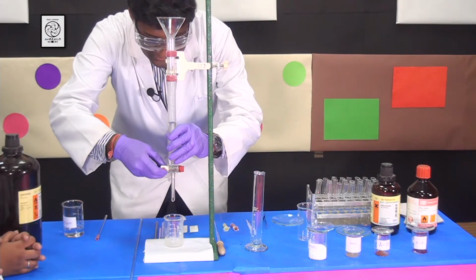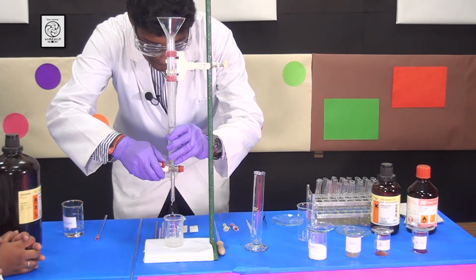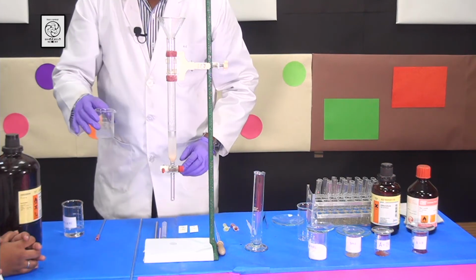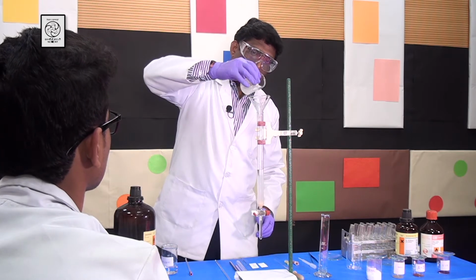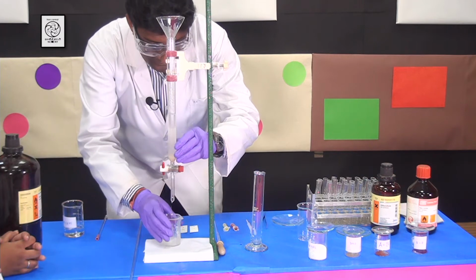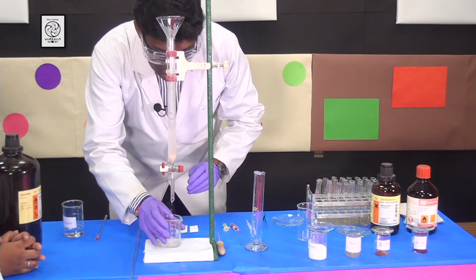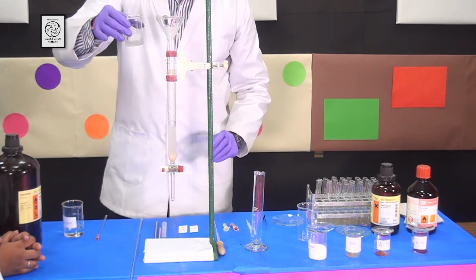Then you can open the stopcock like this, and then you can collect the solvent. Make sure that most of the silica gel is already loaded into the column.